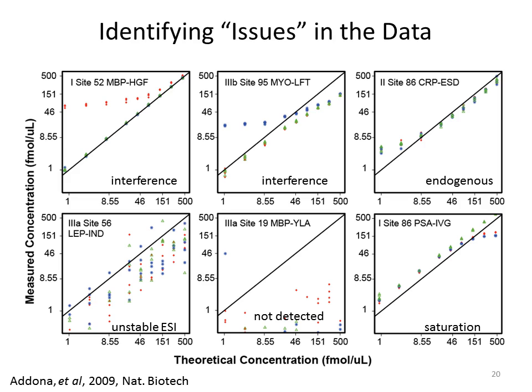Okay. So other things that you can look for in your data that may not necessarily be looking at chromatograms or fragment ions, but when you plot your data, like I mentioned earlier, you should see a response. Every time you add or increase the concentration, your signal should go up. That's just kind of how it works. And if you're able to plot the data on a log scale for your concentration curves, it separates those points out so that you can see them visually.